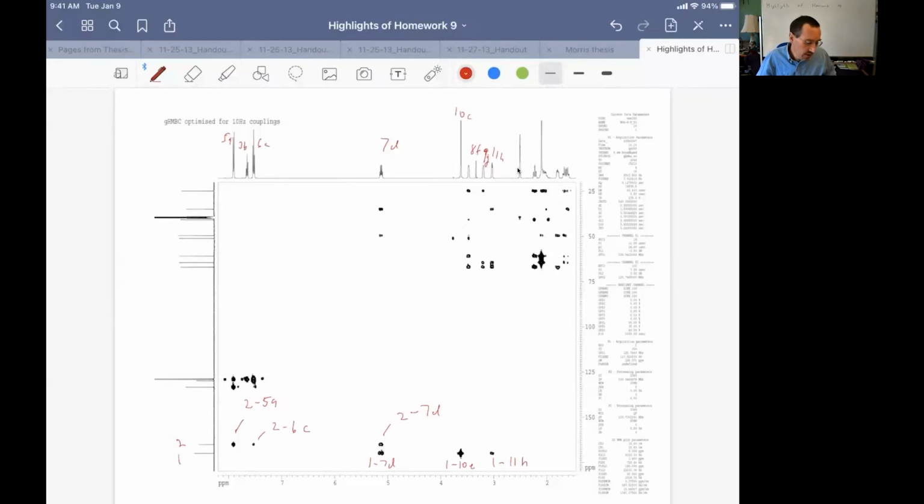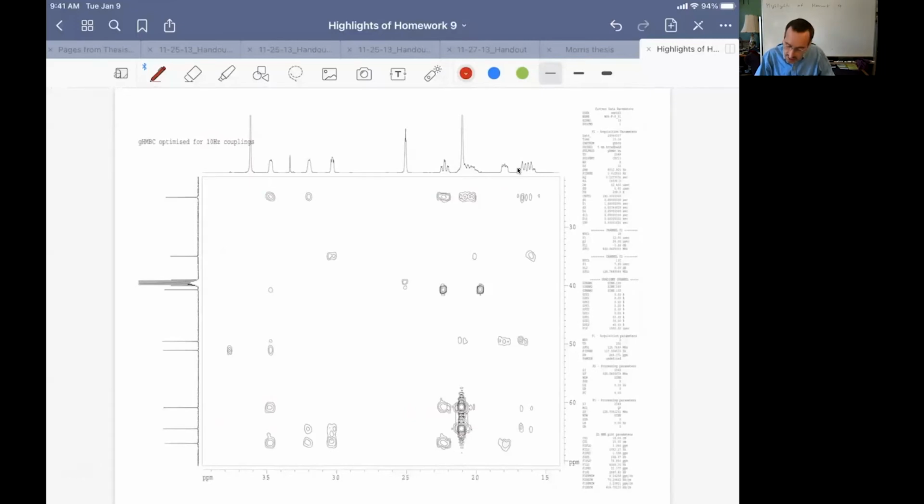So I mentioned here isolated methyl groups, and we've got an isolated methyl group here on the next page off of 12J, and I said that isolated methyl groups can be very, very useful to place. I said that we'll typically go ahead and cross out our vampire bites. I'm just going to number my carbons, and you'll see that right around 12J, we have our HMQC type of peaks here, our vampire bites, as I refer to them. And so I'll cross those out so I don't get distracted.